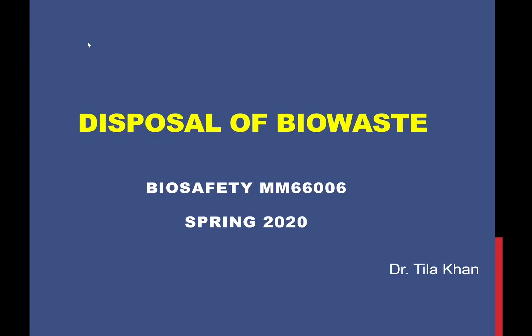This class is on disposal of bio-waste. This is a very important class for you as you will be doing some kind of research work that may generate some kind of bio-waste. This class will explain to you about the kinds of waste that we are exposed to in our laboratory environments and how we can dispose of this waste.